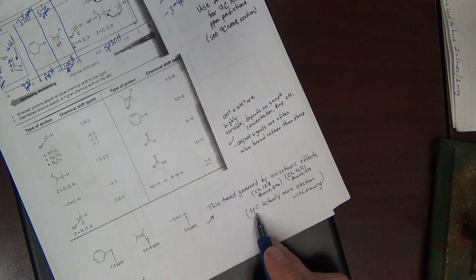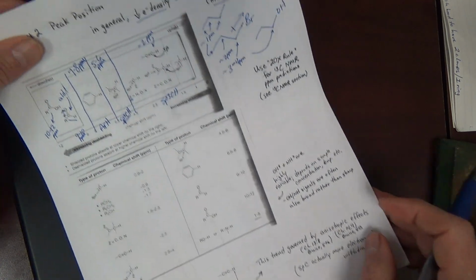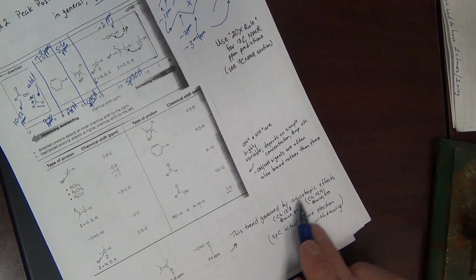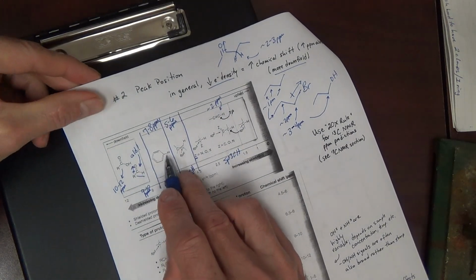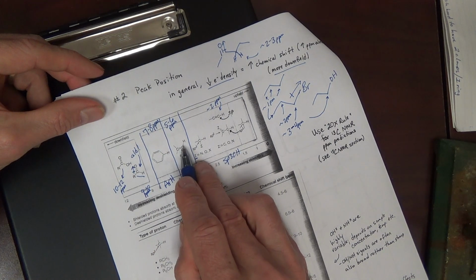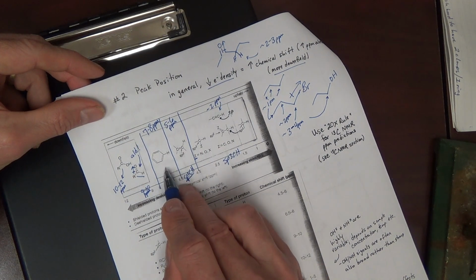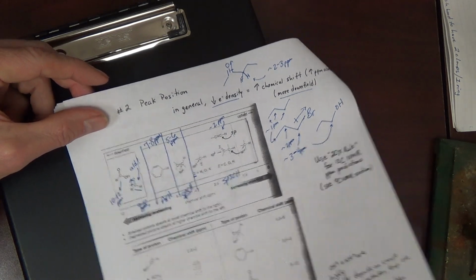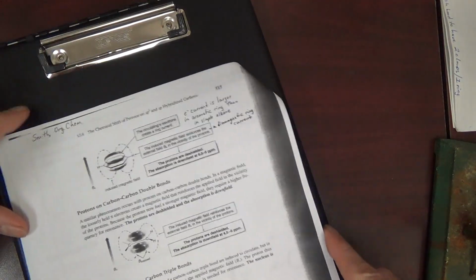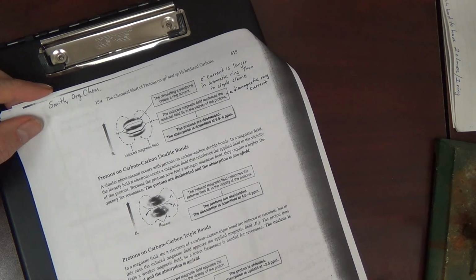All right. We need to look at the anisotropic effect. It also helps explain why the aromatic CH is more downfield than the alkene CH, while they're both sp2 CHs. Aromatic more downfield. The anisotropic effect is explained over here. Anisotropic is basically a fancy term for direction of the field.